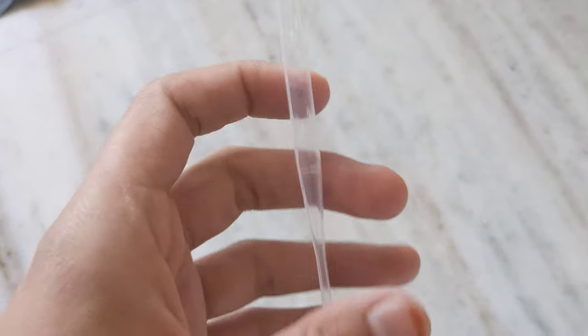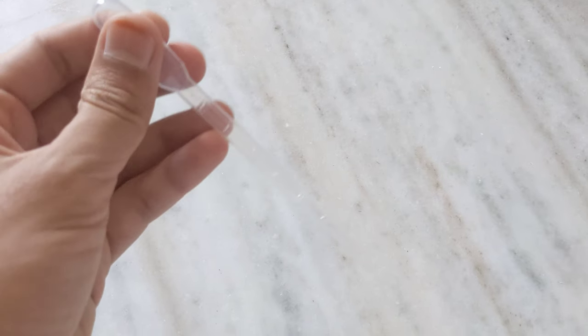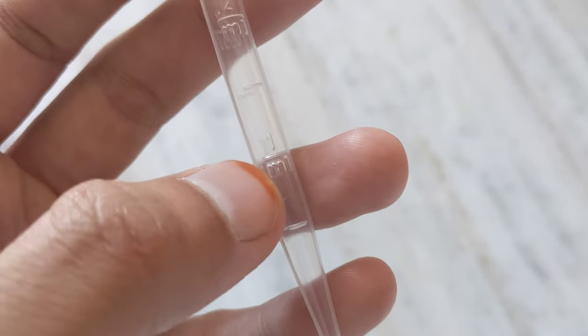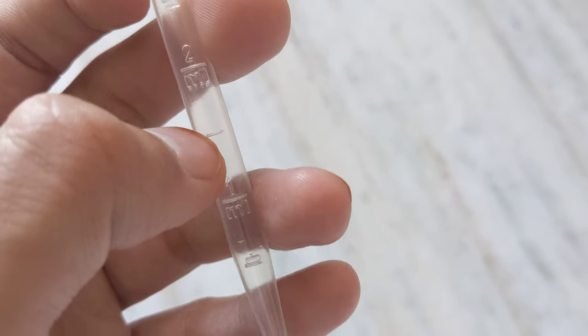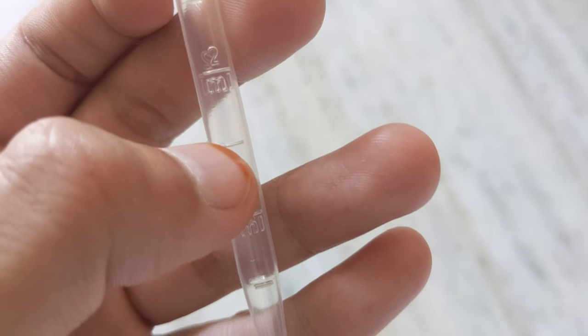Let's say we want to fill ink in our pen — we are using an ink pen — and our ink pen can contain only 1.5 milliliters of ink. Then till here it is one milliliter, and till here it is 1.5 milliliters. So we can fill the ink till here and then fill our ink pen.